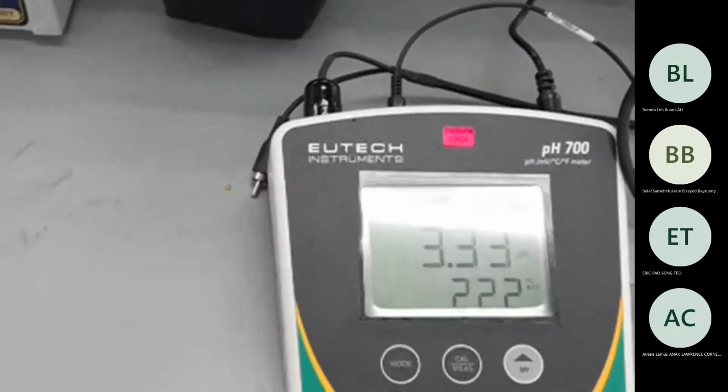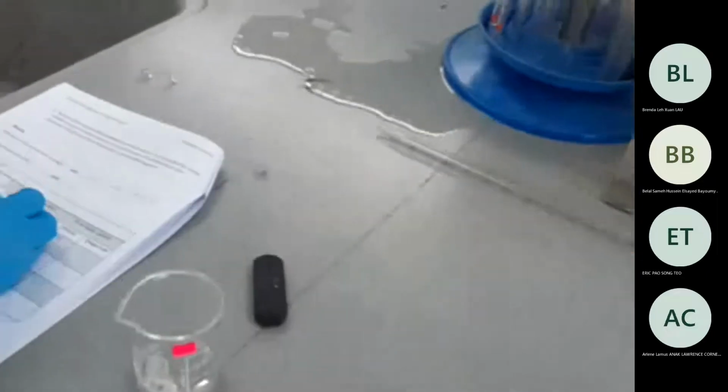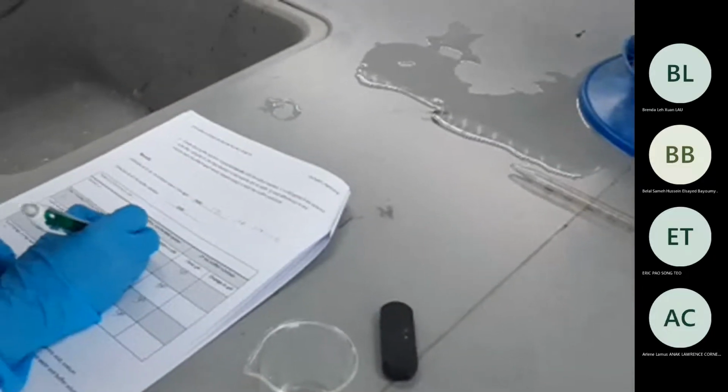Yeah, it's not changing anymore. Yeah, it's ready. So you just take this reading, 3.33, after adding HCl. 3.33, yes. So the same way you do, yeah?